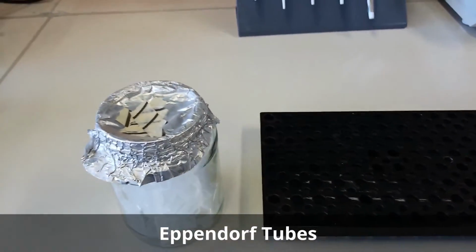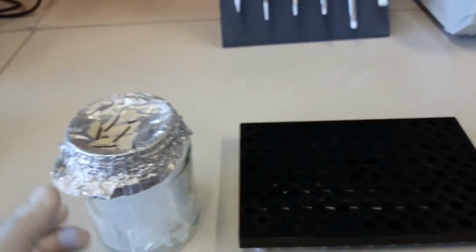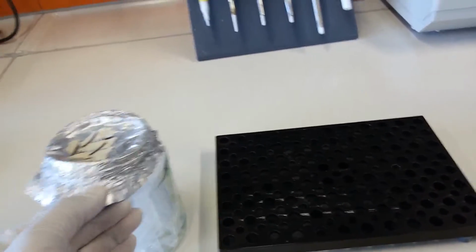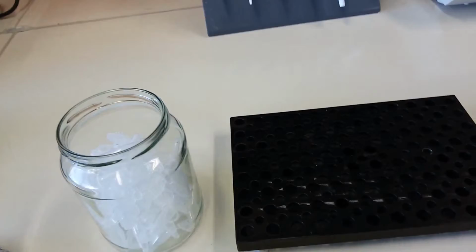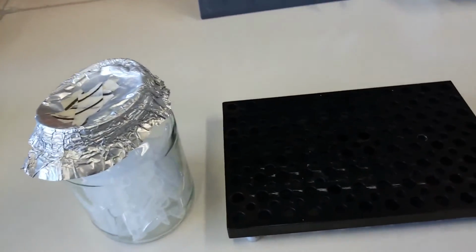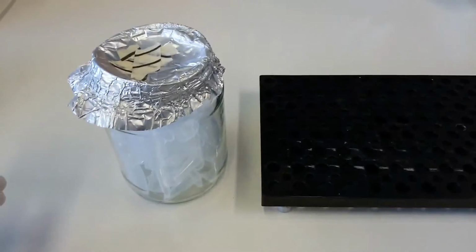We use them for a variety of purposes, and they can be of different volumes. Generally the most common and popular Eppendorfs are 1.5 ml. They are closed with aluminum foil because we use them after sterilization.